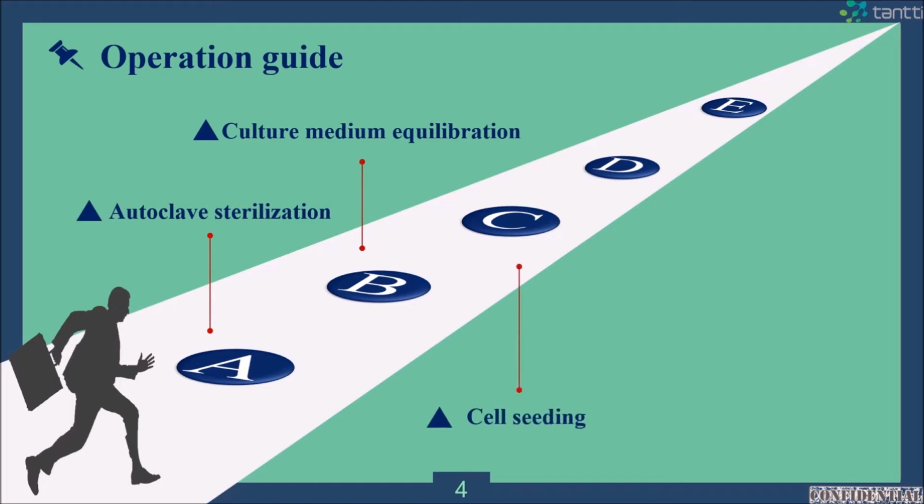Third, cell seeding. The required stem cells are directly added to the bioreactor. Fourth, cell expansion and sampling. Homogeneous sampling is required to estimate the cell numbers during expansion in the bioreactor. The last step is cell recovery. All TAN-T UniTantrix can be degraded by trypsin EDTA, and the stem cells in the bioreactor are then recovered. Next, let us watch the operating video to illustrate these experimental steps.